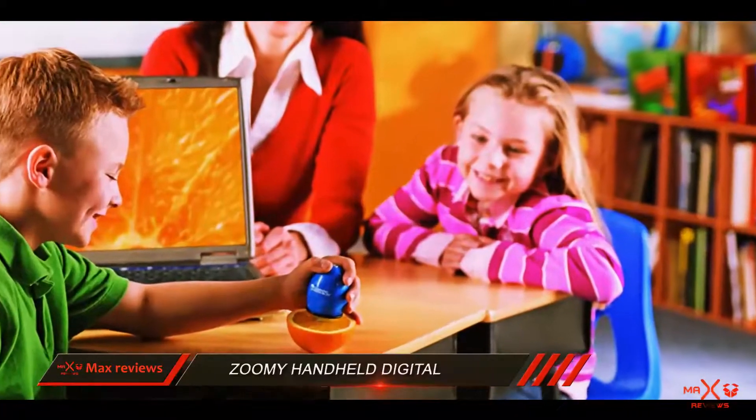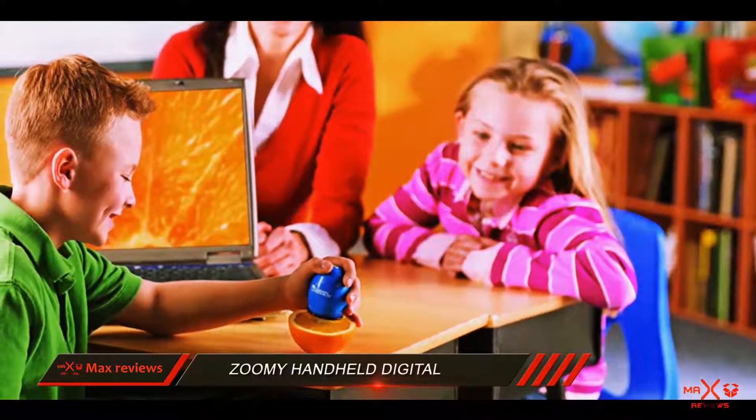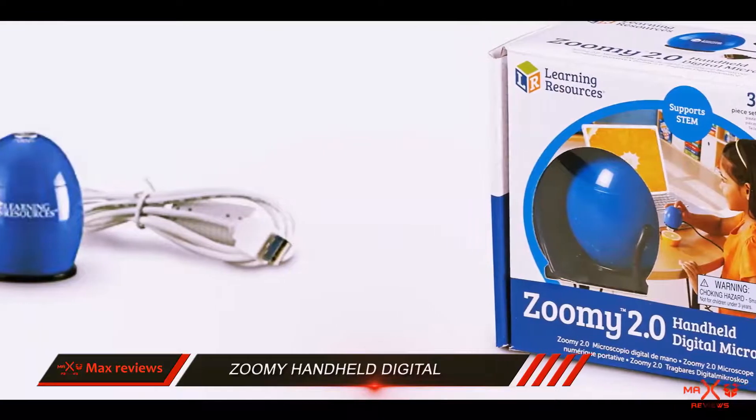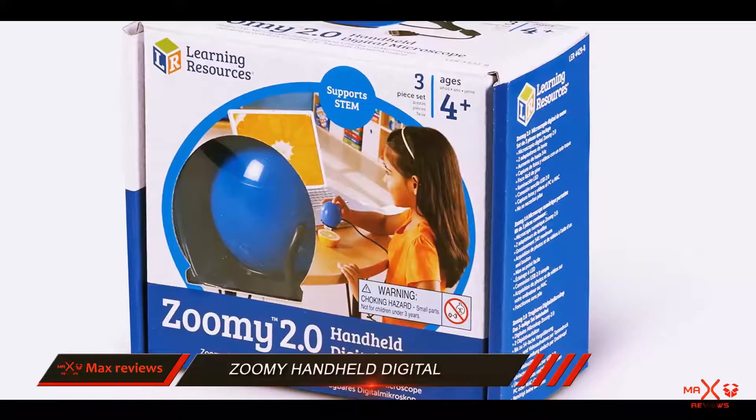You can change the magnification by rotating the top of this device. So if you have a child, you can easily motivate him to have a closer look at things with the help of Zumi. The price is affordable, and the shape is just what a child would want to spark their natural need for knowledge.